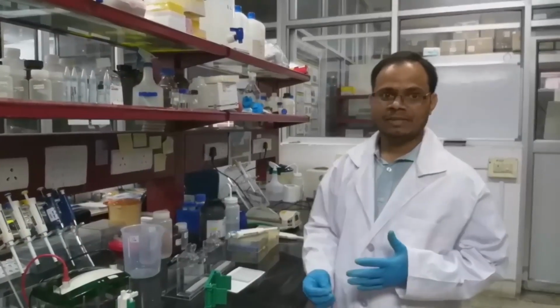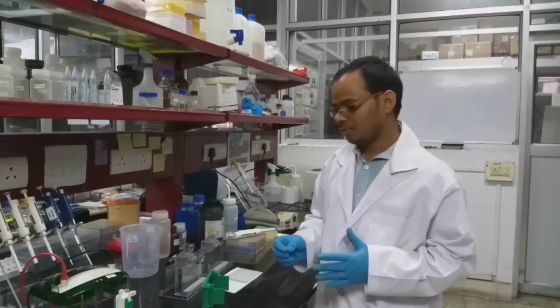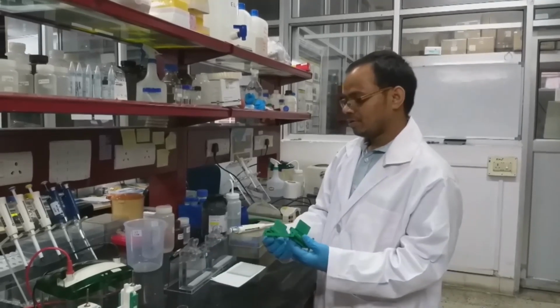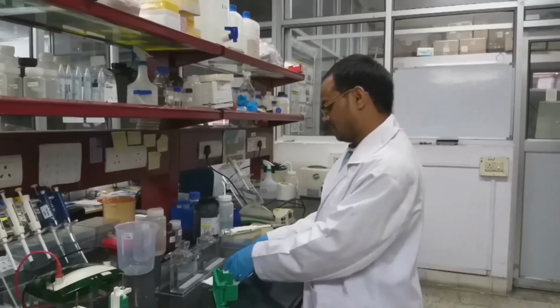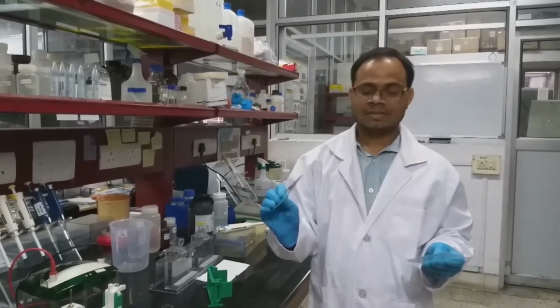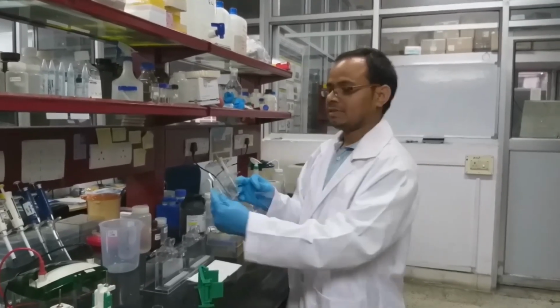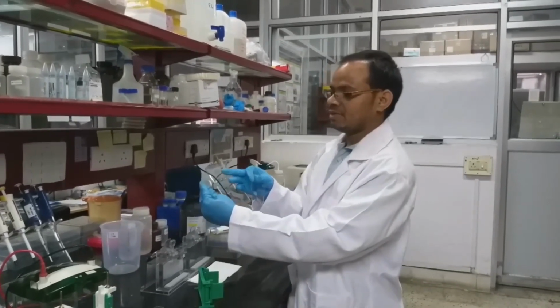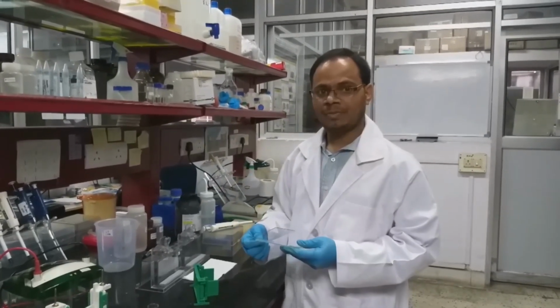Before preparing the resolving gel, we have to set up the casting gel. So these are the glass plates. This is a very thin one. So this is the main glass plate. This is a 1.5 mm glass plate. It is available in 1 mm glass plates also.